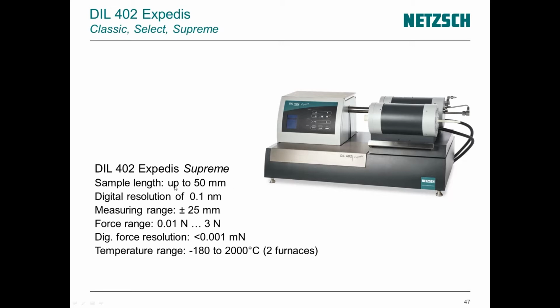You can apply forces between 10 millinewton up to 3 Newton, and we can cover a temperature range here between minus 180 up to 2000 degrees C. And what we have here in this device is a force-controlled measuring cell. So in this case we control the force during the entire measurement and keep it constant.